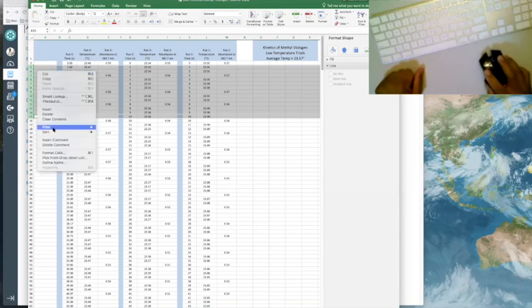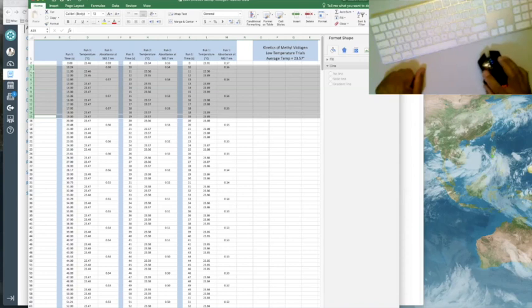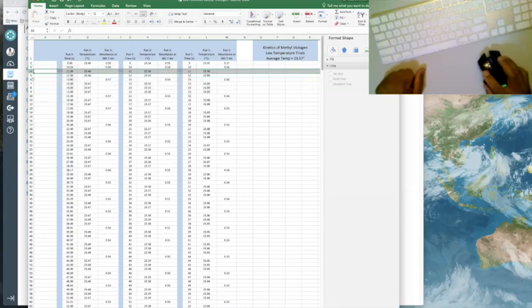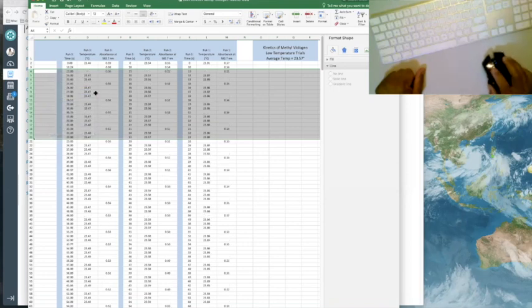And I can do that by just deleting that. Okay, then I want to delete, say, 11 all the way to here so that I keep that 23.05. So you're just going to have to do it by inspection. And you need to thin out so you get 20.